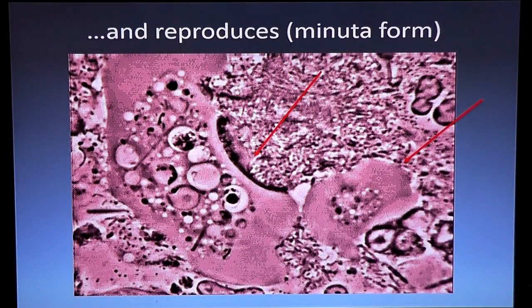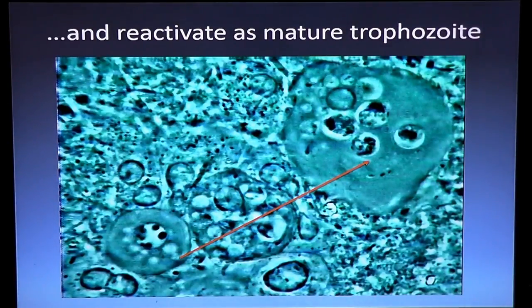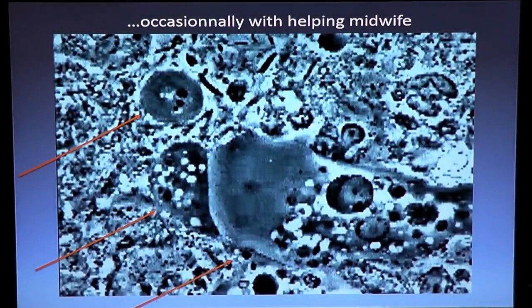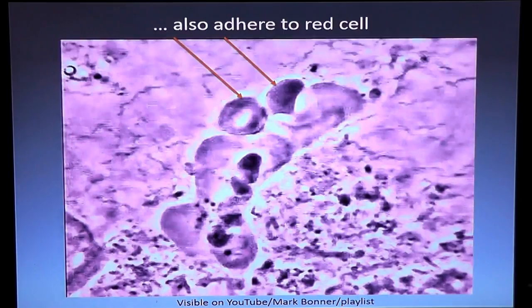Reproduction is easy to see within the sulcus of patients. You see the amoeba has just released a little minuta form that has separated from the mother. You see the small one, the baby one. You see the nucleus that will form chromatin and karyosome, then you see a young amoeba, and then you see the adult amoeba with its pseudopod — very reactive, what we call the trophozoite, because it can go everywhere within the sulcus. Sometimes you can even see one amoeba helping another release little baby amoeba. They do reproduce and help each other within the infected sulcus.